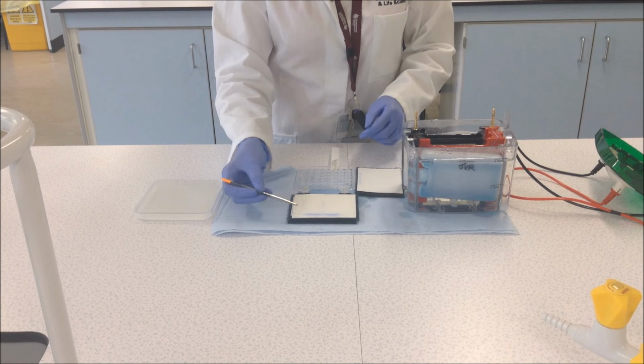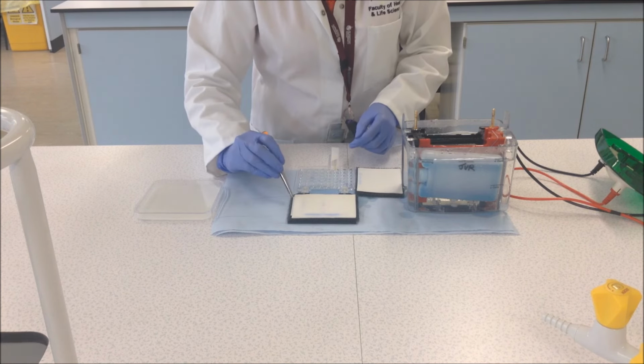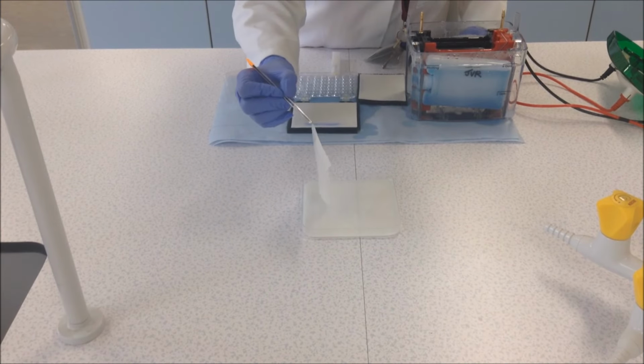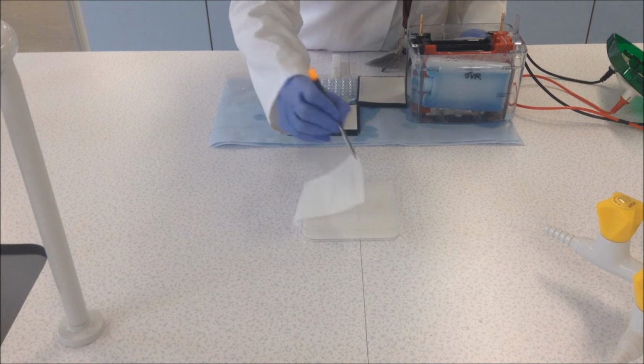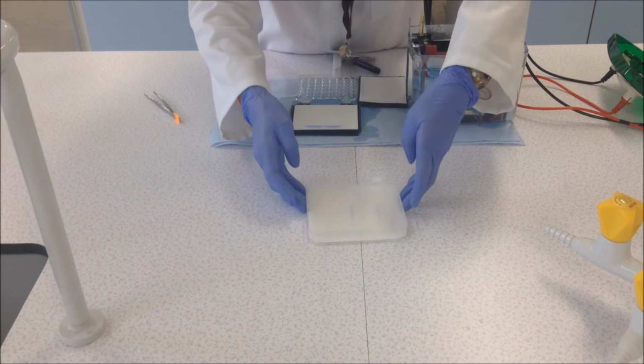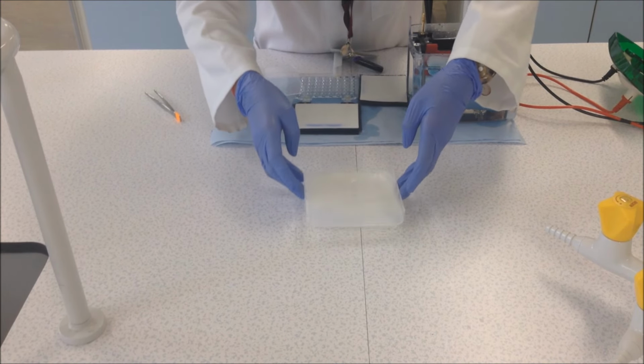From here, you should be able to see whether your proteins have transferred successfully or not. You must then place the nitrocellulose membrane into some blocking solution. This will prevent any non-specific binding from occurring later on in the process.